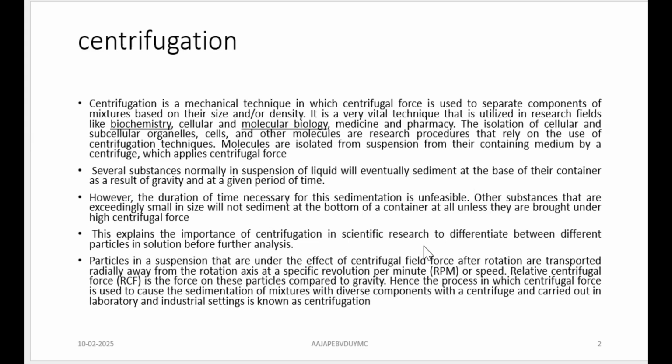And what is the distance of the particle from the axis of rotation? These are the three important things. Whether the particle is closer to the center of the axis of the centrifuge machine or away from it. If it is away, very shortly it will reach the outer wall of the tube, and it will slide down and settle. So these three are the important components from the machine point of view to get a good separation or good sedimentation: the centrifugal field that you are applying, the time of application given, and the distance from the rotation axis.